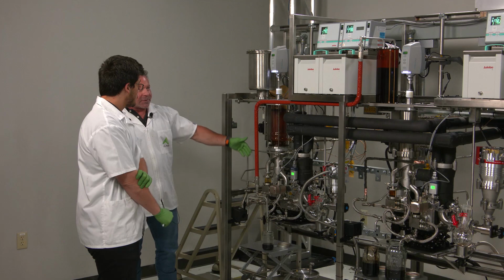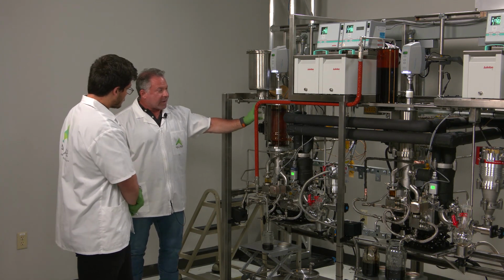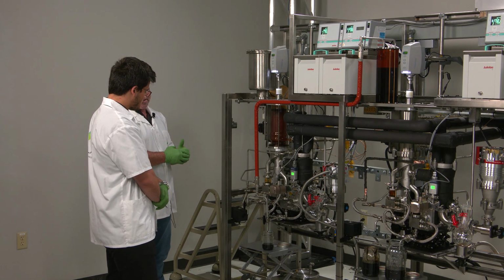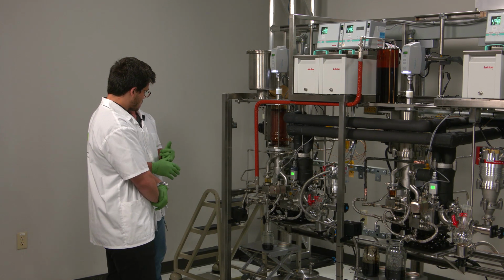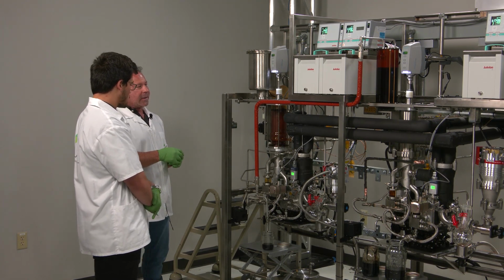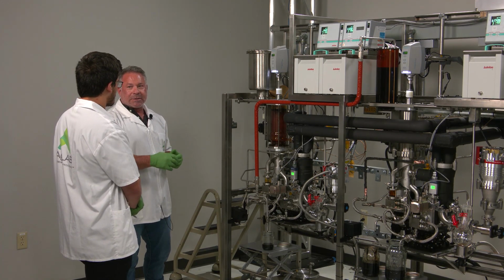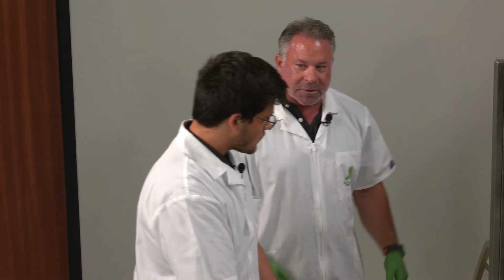The reason that you have these differences in temperatures between all these areas is because you want your evaporator doing what it says it is, and then evaporate. It evaporates our lighter molecules right now, which is our terpenes, solvents, other molecules that are within that range. And those are lighter molecules, a little bit different configuration than what CBD and THC and our other heavy molecules that are coming through on our residue side are.